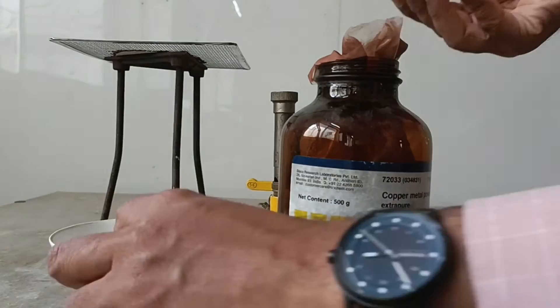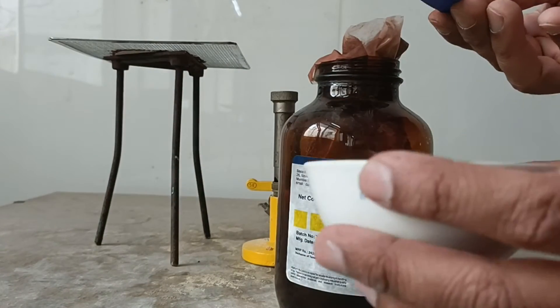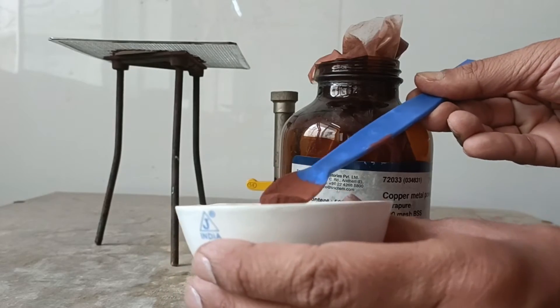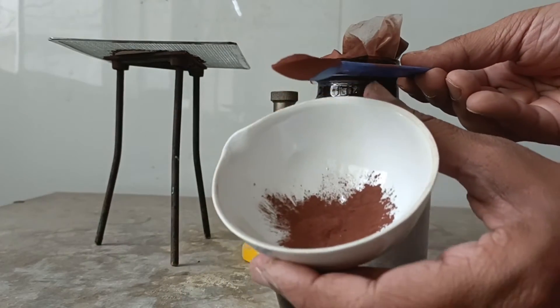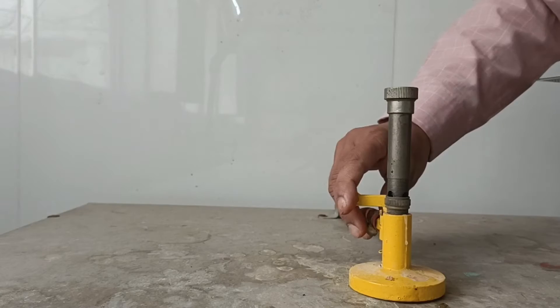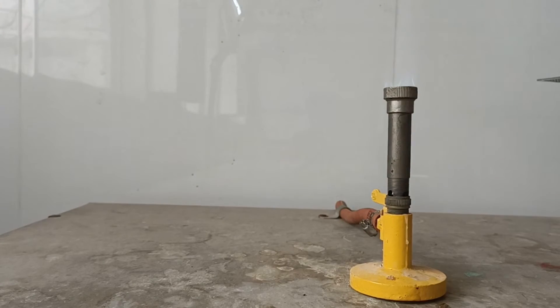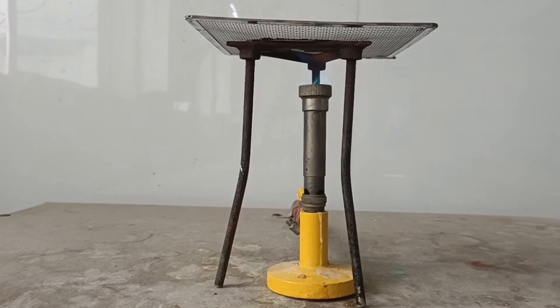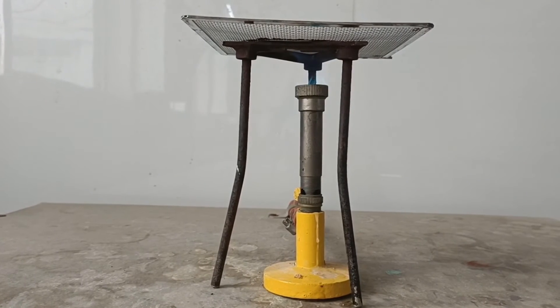Let's take some copper powder into the crucible. You can very well see that it is dark brown in color. Let's start the Bunsen burner, place a tripod and the wire gauge over it, and put the crucible with some amount of copper powder in it.